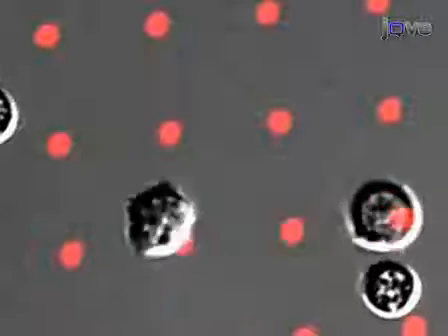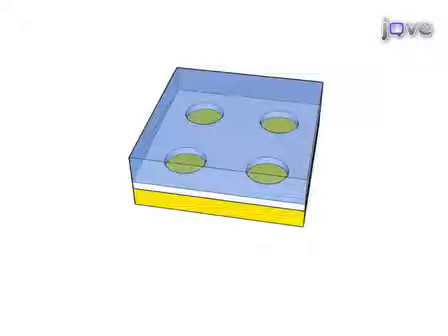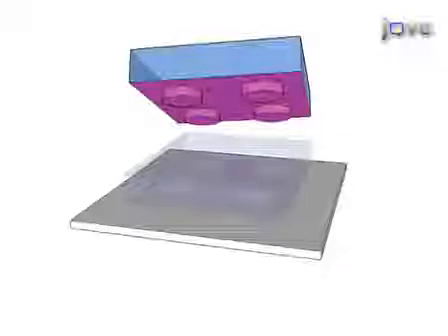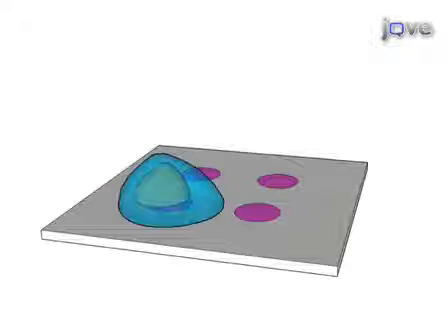Microcontact printing is used to pattern proteins and other molecules on material surfaces to recreate the complexity of extracellular environments. To begin microcontact printing, a topological master is created and then soft lithography is used to cast a stamp from the master out of Silgard. The stamp can be coated with protein and then used to stamp proteins on a new surface on which cells can adhere.